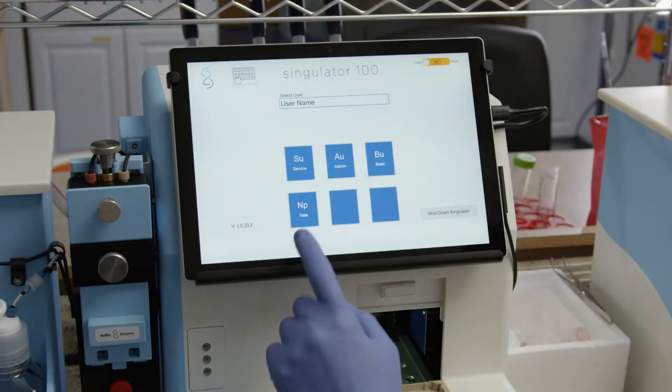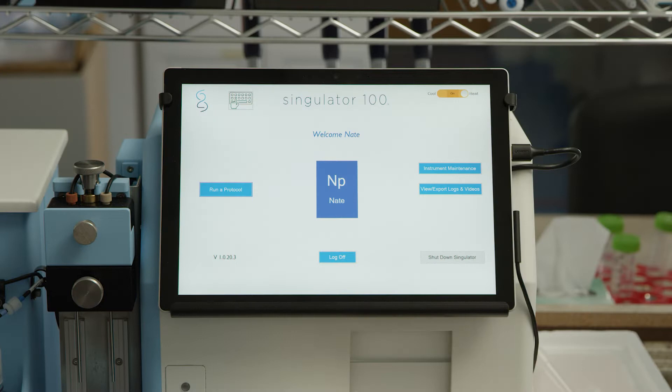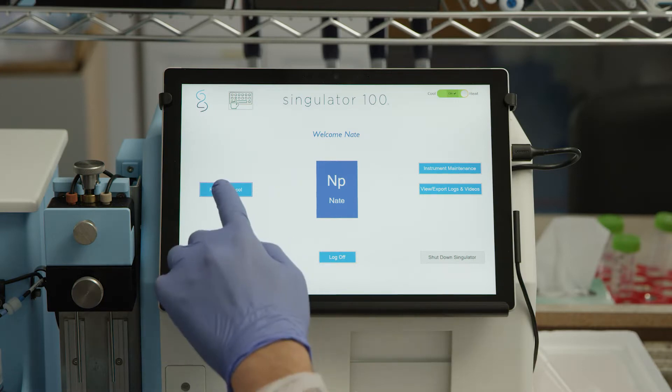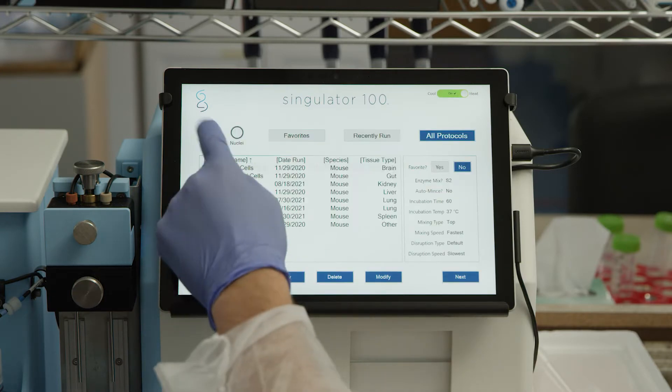Login to the Singulator software as an admin or basic user, or use your personalized user ID and password. Select the option for cell isolations.